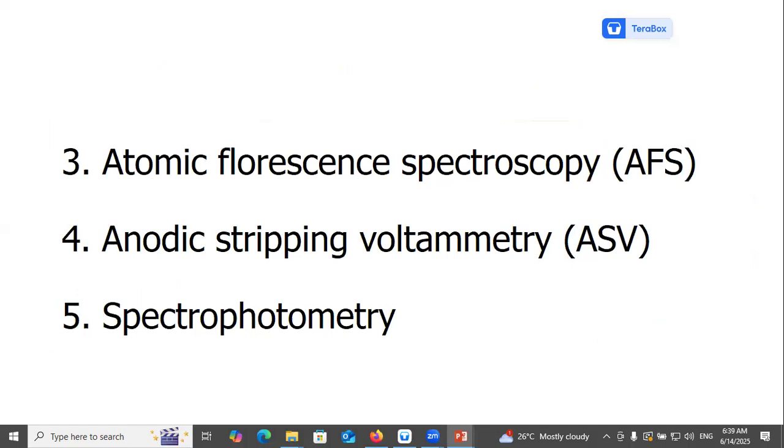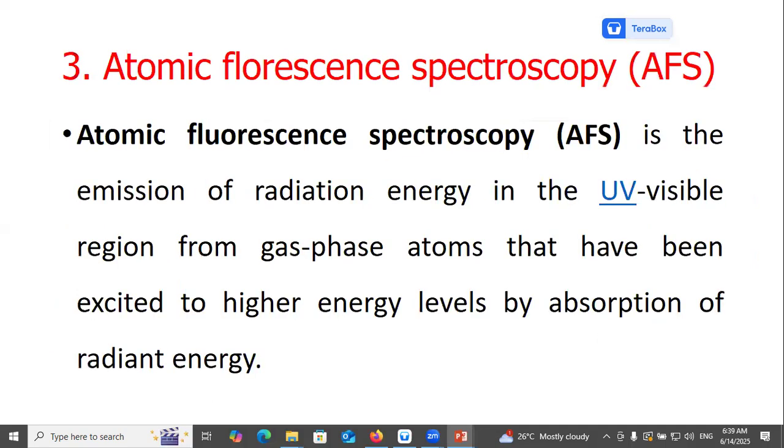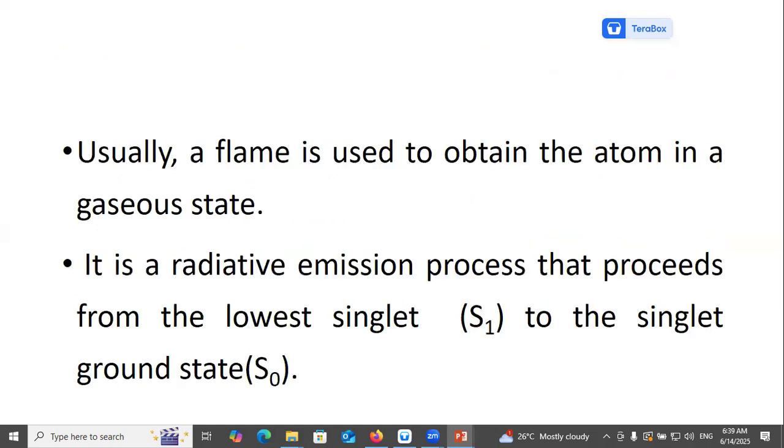Atomic fluorescence spectroscopy, anodic stripping voltammetry, and spectrophotometry. Atomic fluorescence spectroscopy is the emission of radiation energy in the UV visible region from gas phase atoms that have been excited to higher energy levels by absorption of radiant energy.